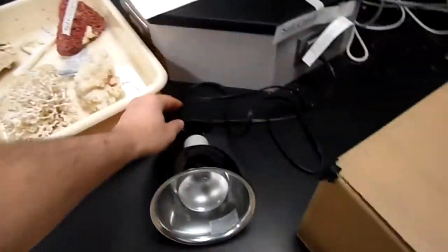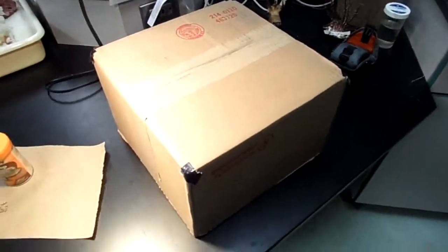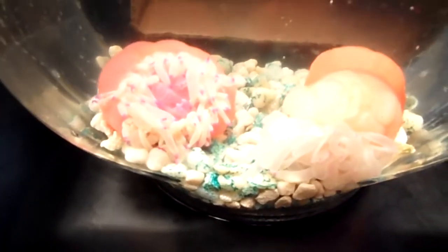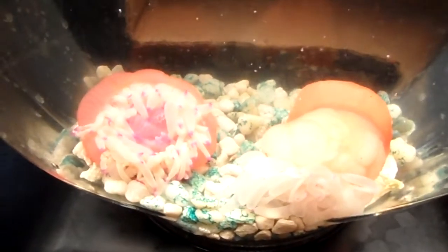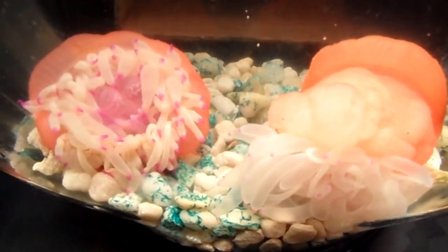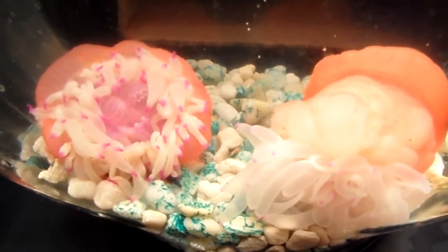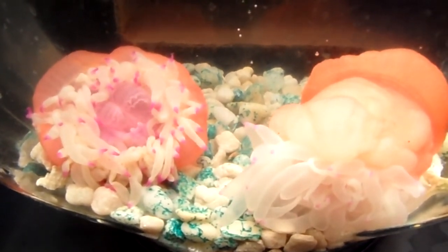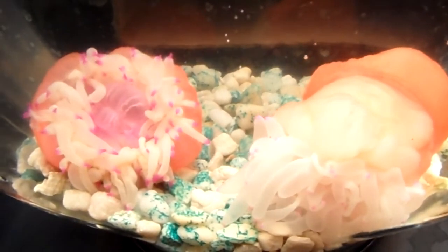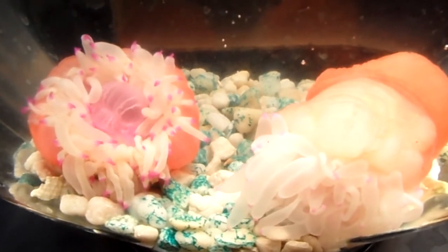So I'm going to go ahead and turn the lamp on. Excuse me. It's rather bright, as you can see. And here we go. Hopefully the camera is adjusting its light exposure for you. Now, nothing with anemones happens fast. No behavior happens fast, so we need to watch for a while and see if there's anything that could be construed as a reaction to the light.